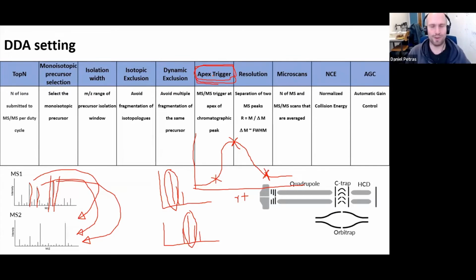And I think for non-targeted metabolomics and really MSMS based stuff where you want to go as deep as possible, the number of MSMS scans, not wasting them, but only getting them placed at the right time, is really important to get more coverage. Yeah, because I noticed also quite a few times at my chromatographic peaks that I don't get the acquisition at the top one, which was really weird to me. But yeah, good to know.